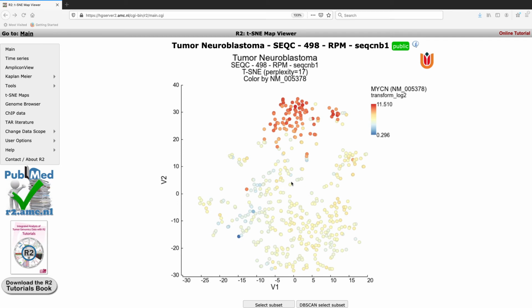So we've now looked at examples of both the principal component analysis and the tSNE maps for dimensionality reduction algorithms. And there is one more example that we'd like to show you, and that is UMAP, otherwise known as Uniform Manifold Approximation and Projection algorithm.